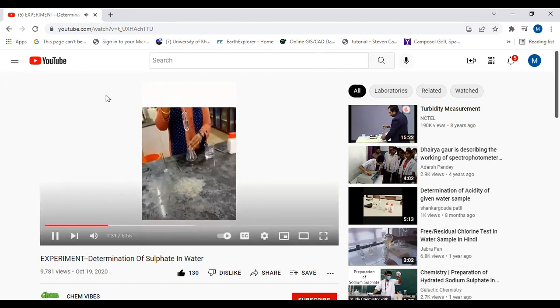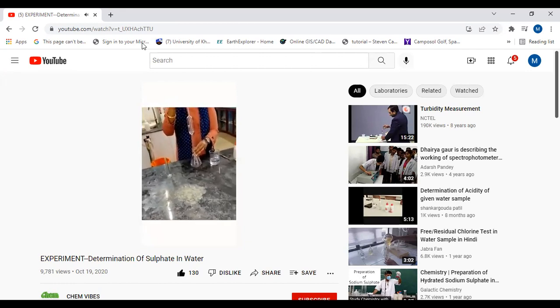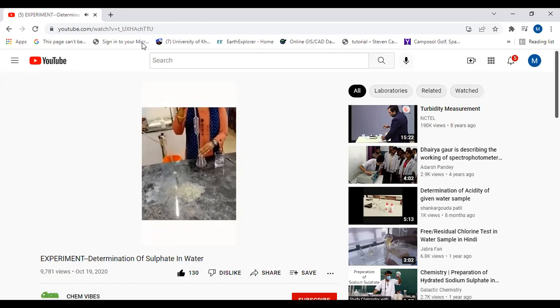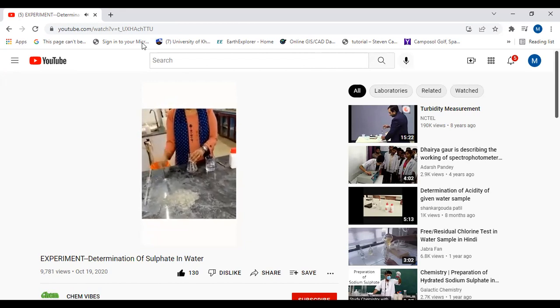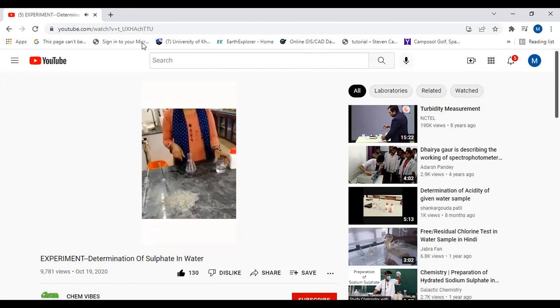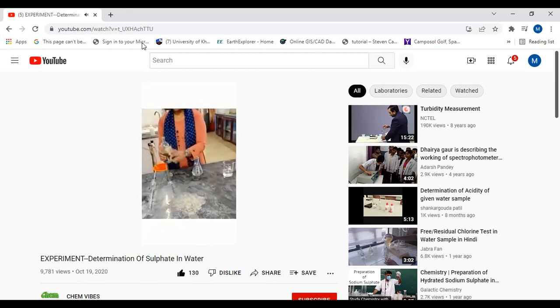You see the video, yeah? Yes, she doesn't respect the safety for the laboratory measurement. No gloves, no pipette, no pro-pipettes.